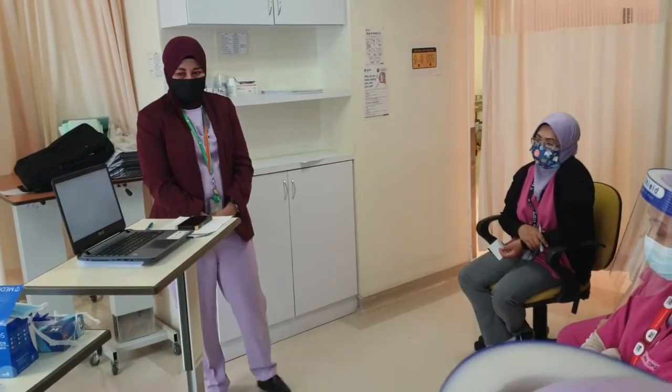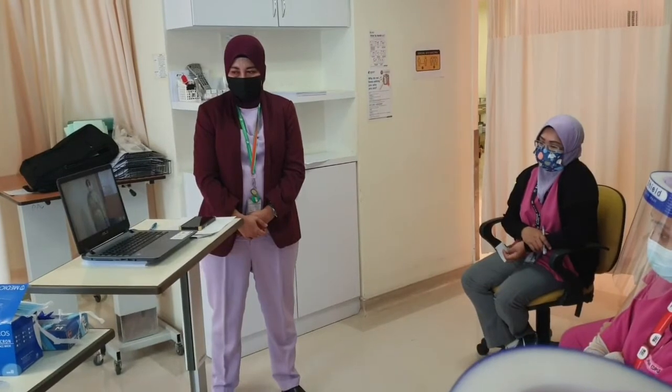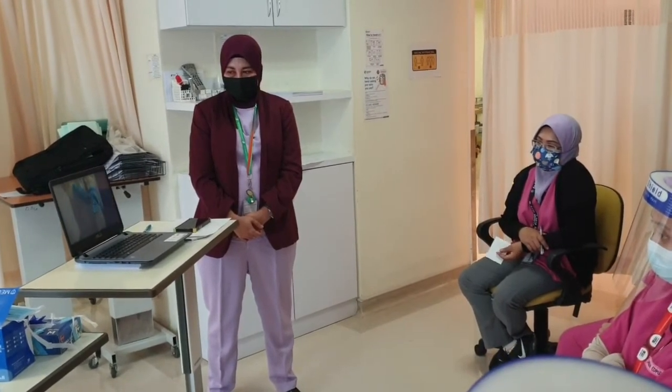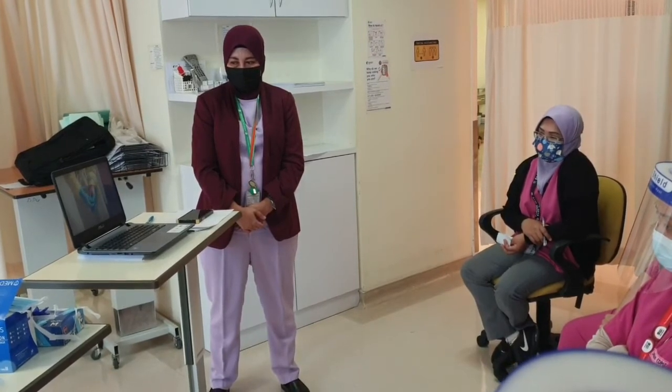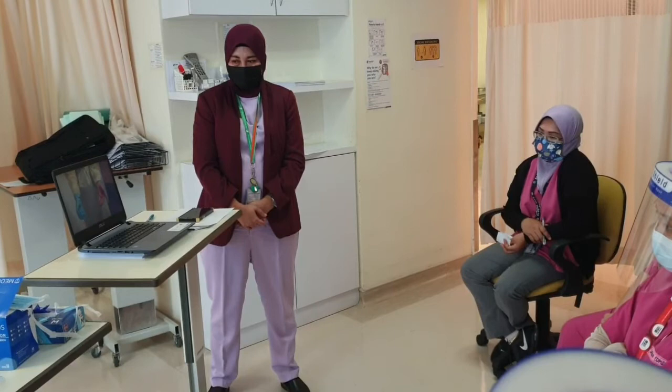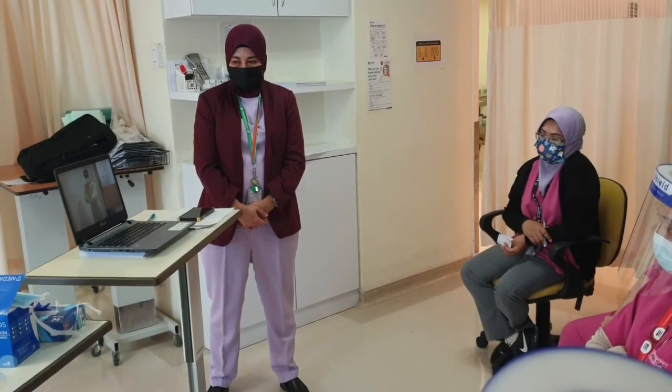When doffing your PPE, step into the anteroom, ensuring the door is closed. Remove the first glove by pulling it up and away from the middle of your palm, ensuring no skin contact. Hold the glove in the other hand. To remove the second glove, place a finger inside the clean area of the glove and push it off, balling up both gloves together. Throw into the garbage.